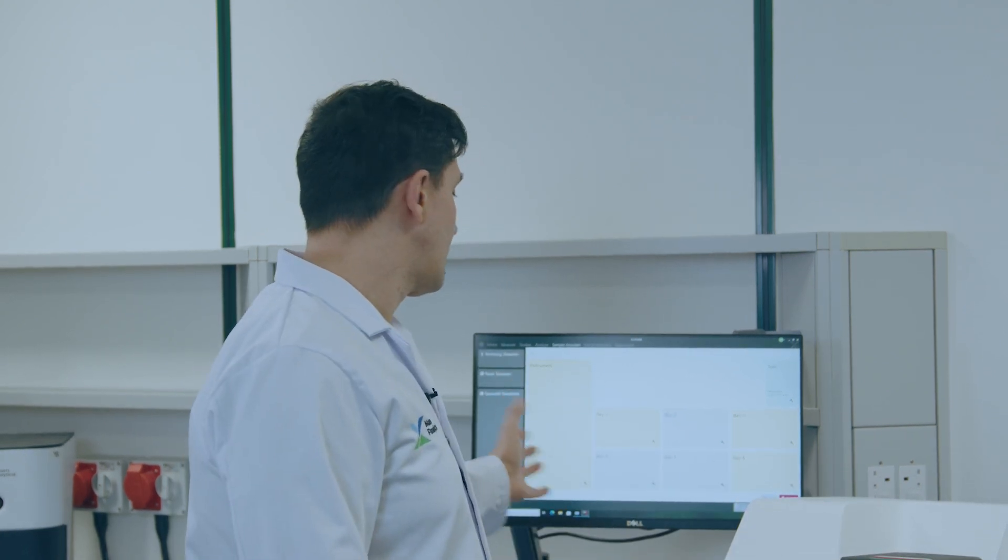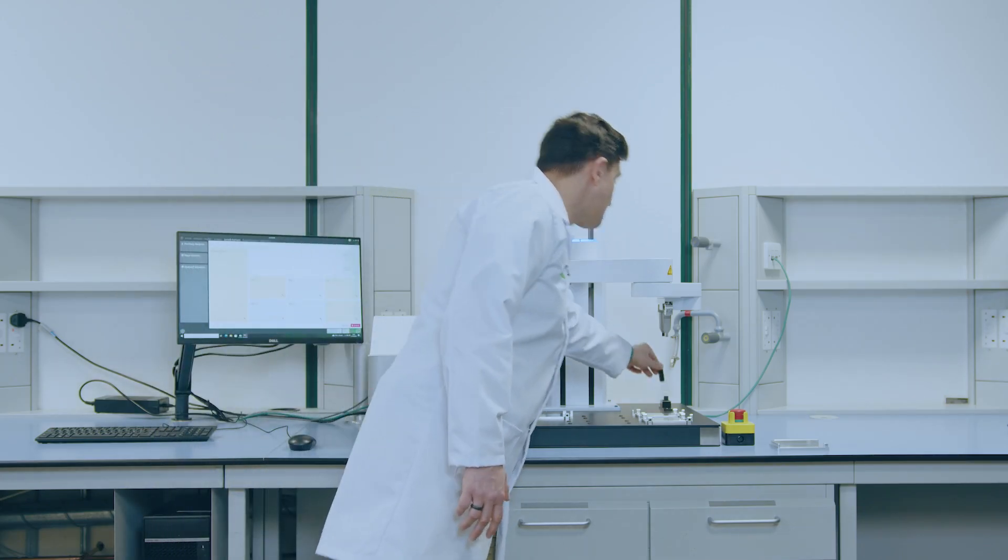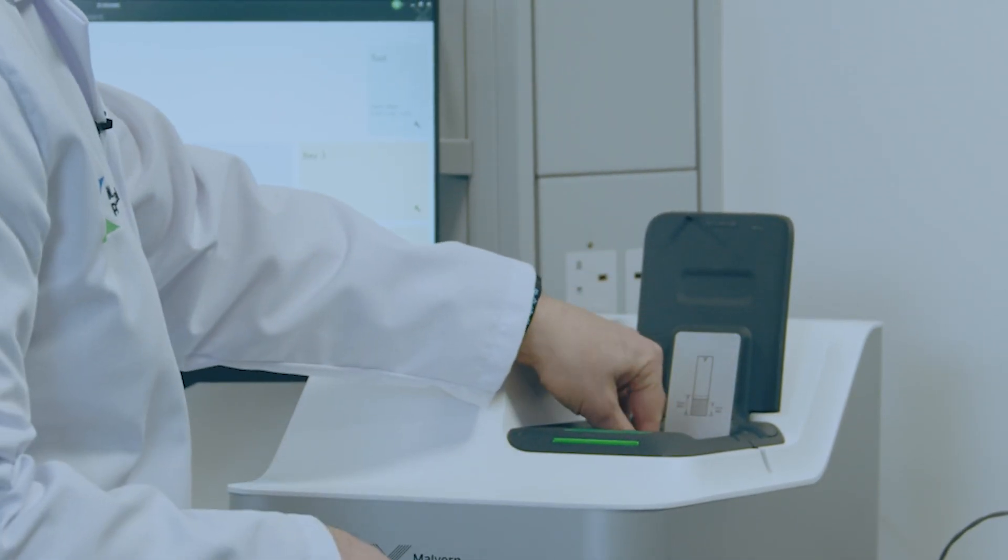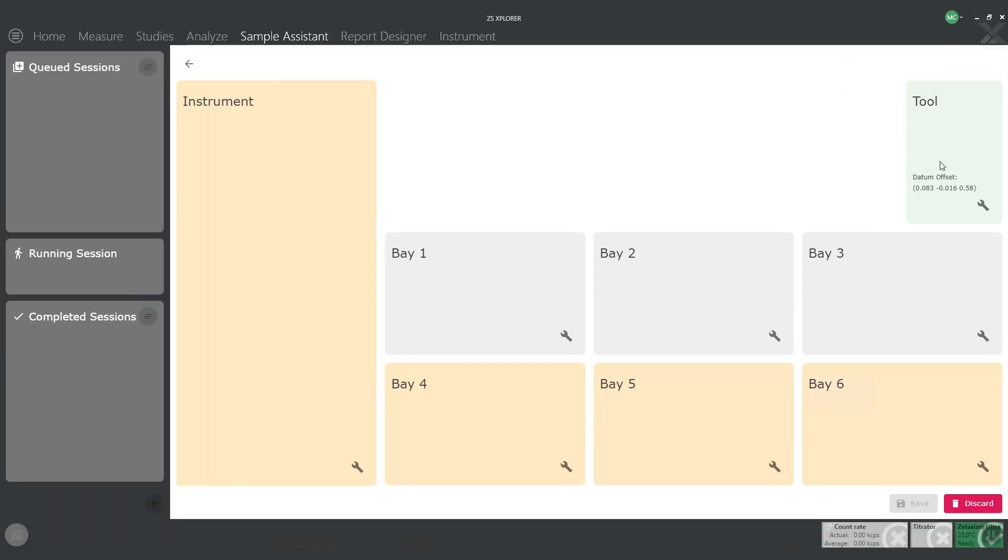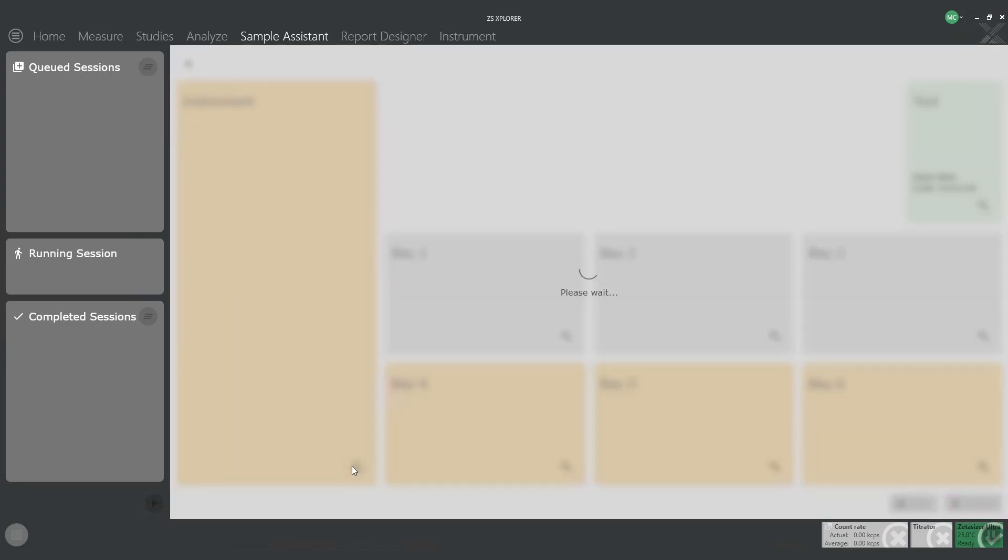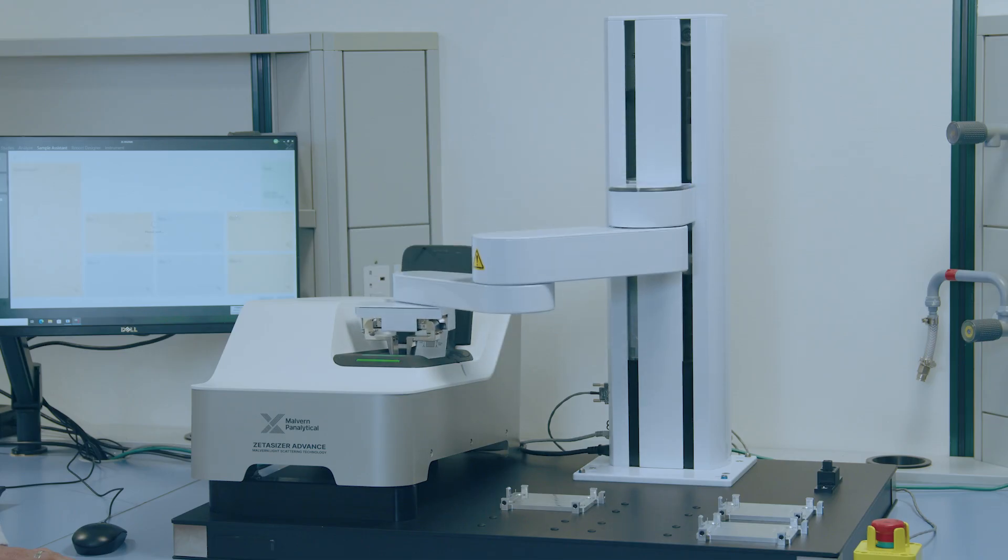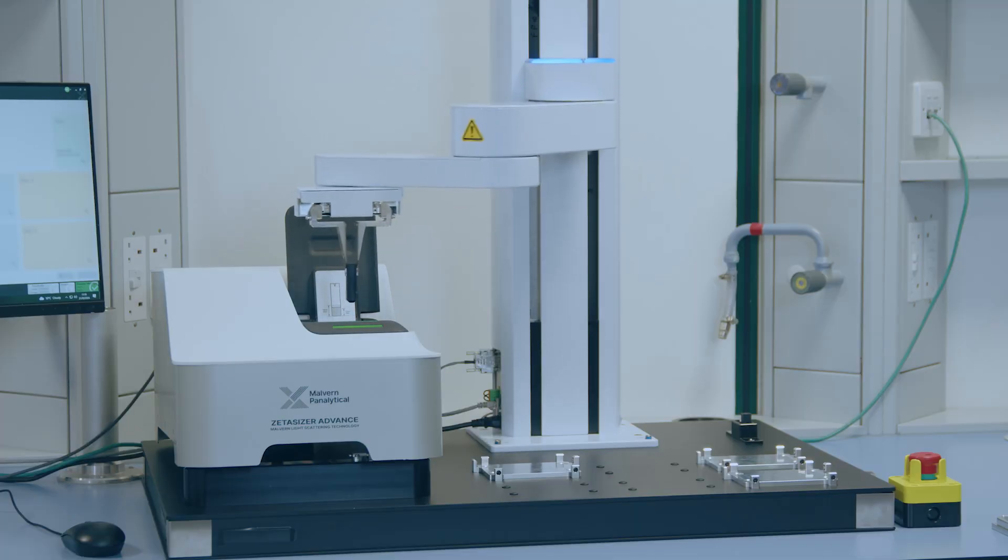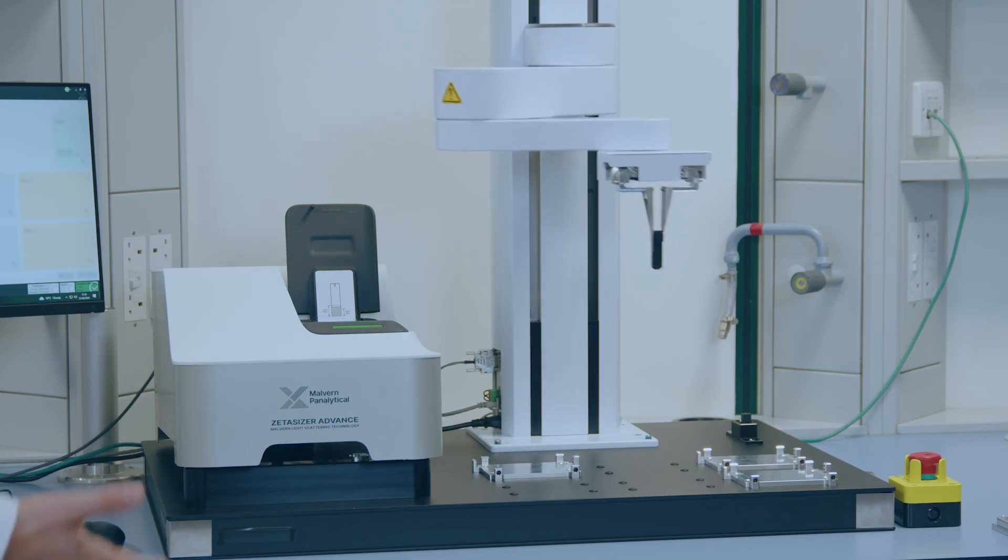Once we recorded the tool holder position, the next operation is to configure the position of the Zetacizer itself. For this operation, we need to take the datum tool and insert it in the Zetacizer. Once the tool has been inserted, you can just press the configuration button on the software and wait for the robot to record the position. Once the software is happy with the configuration, the arm will extract the datum tool and place it back in the tool holder.